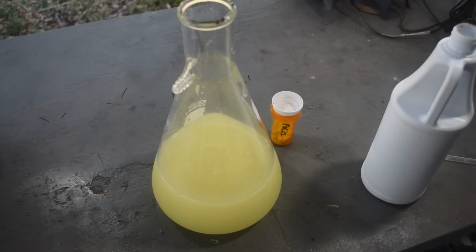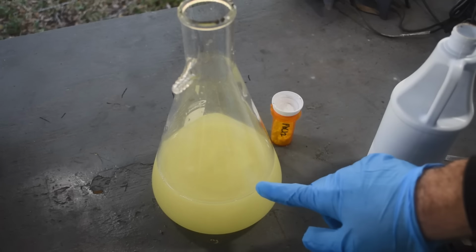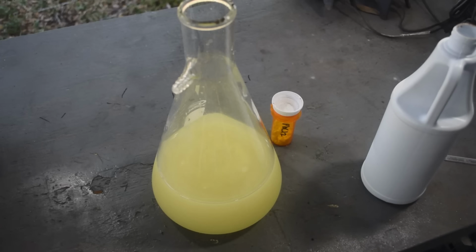Those big lead chloride crystals, yeah, those will filter out easy. But this lead sulfate is a fine, fine precipitate. And yeah, we're probably going to have to gravity filter it with some cotton in the funnel to catch all that. Hopefully we don't have to run it through two or three times to get it all out. Okay, let me get set up for that. And we'll filter it again. Then we'll drop the gold.